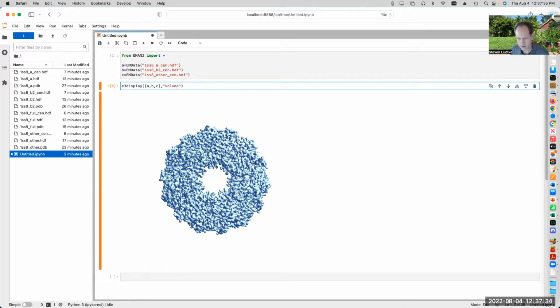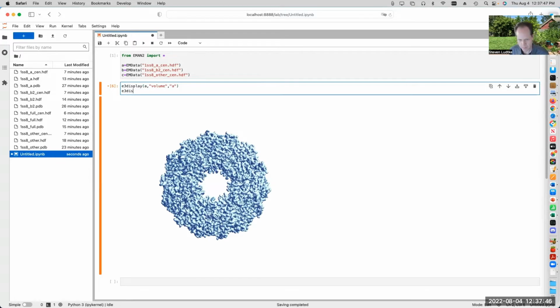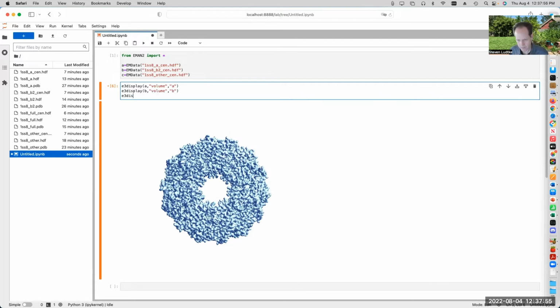Yeah, all right. Let me separate it out so I can give each one a name. A volume, and we'll call it A. And E3 display B volume, and give it a name. And E3 display C. Give it a name. Oh, actually, it's going to be the name of the window. I need to give the name of the data object or test.